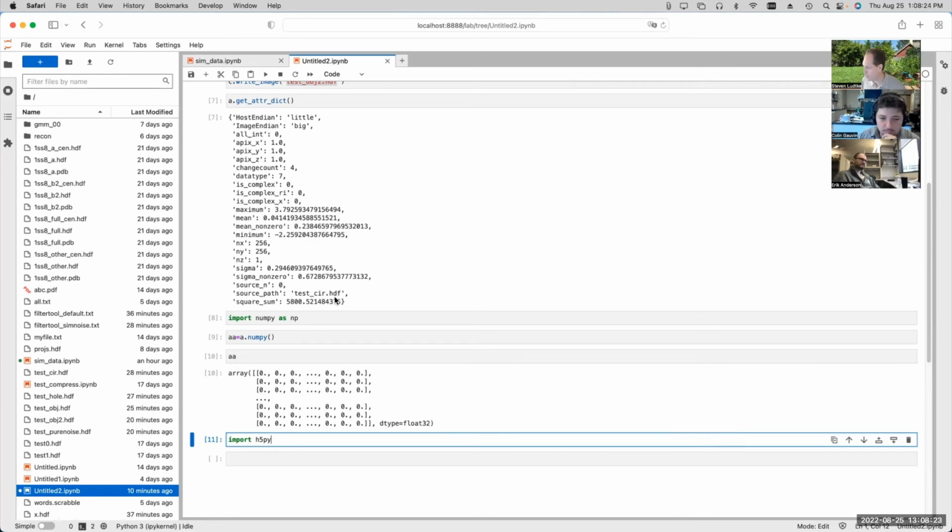So the data compression that we're talking about in the paper really starts at the level of once you've done the movie average and done the gain normalization. That's the point at which it makes sense, when you save those, to use the bit truncation scheme. So you're taking these TIFF stacks that are already compressed as they're written, in theory, and then frame aligning them, and then saving those aligned frames as compressed HDF with the bit truncation.